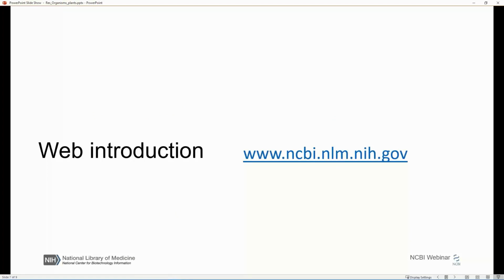Okay, so with that, what I'm going to do is go over to the NCBI website, and that's the URL there. I'm just going to run through a quick demo on the website about how to get some of these data. And then we'll switch over to the Jupyter notebook and Adelaide.